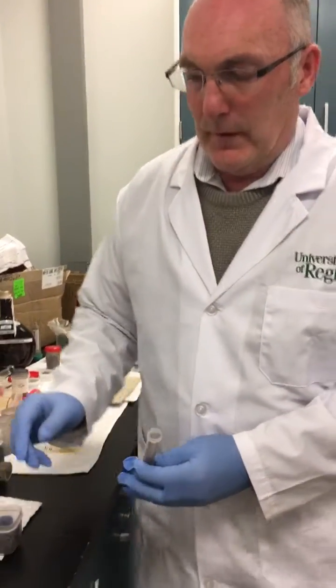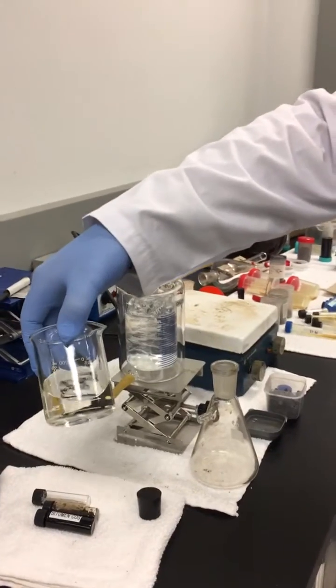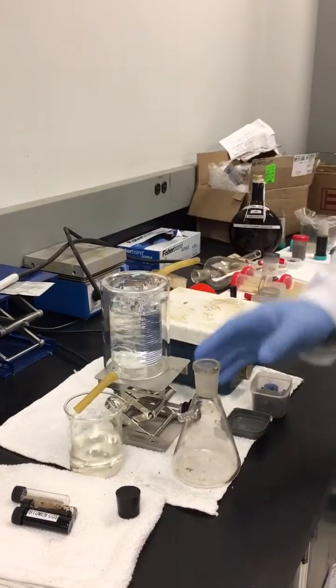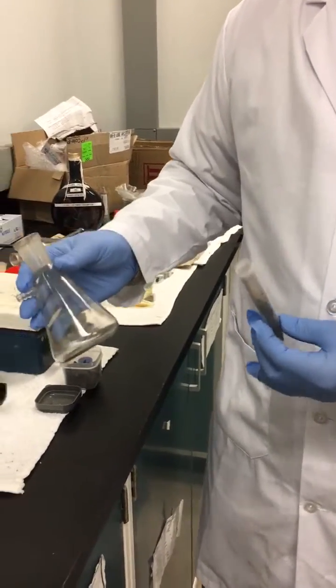We're going to show that by bringing into contact pure liquid catalyst — this was the recovery of the original liquid catalyst from SunCourse feedstock — we're now going to reuse the same batch and bring it into contact with the South American oil shale, then raise the temperature gently.